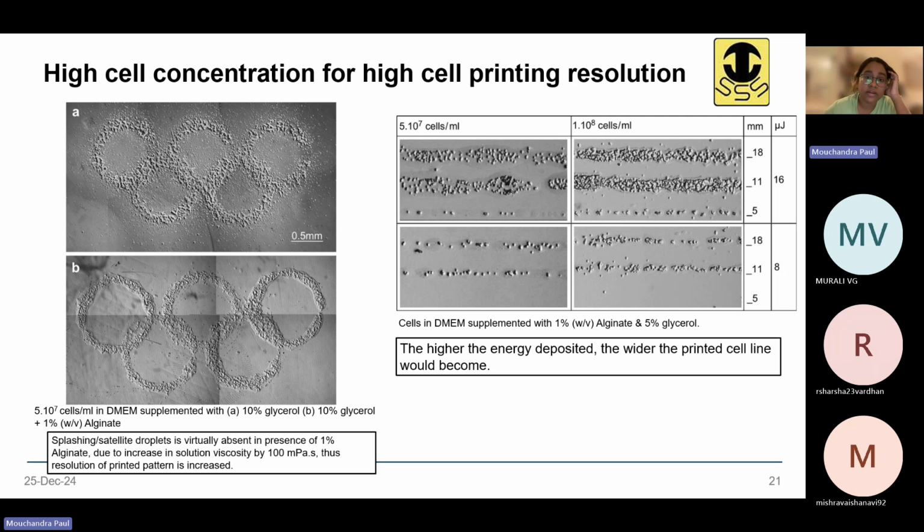You can explain the variation in thickness using this point, right? Here also you can see the cell number. When we are increasing the cell number, you see the droplets very close to each other. All right. Is it clear now, the results that I'm showing here? Yes, ma'am.